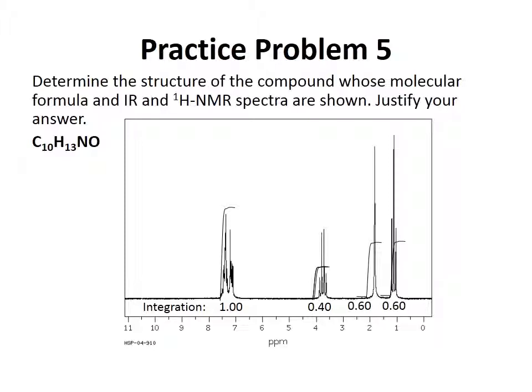You need to use integration and you need to use splitting. And if you have more than one possible answer, you need to use chemical shift to determine which answer is right.